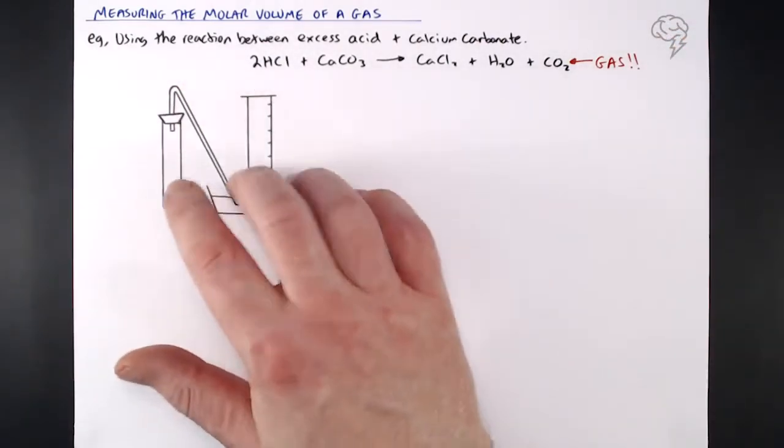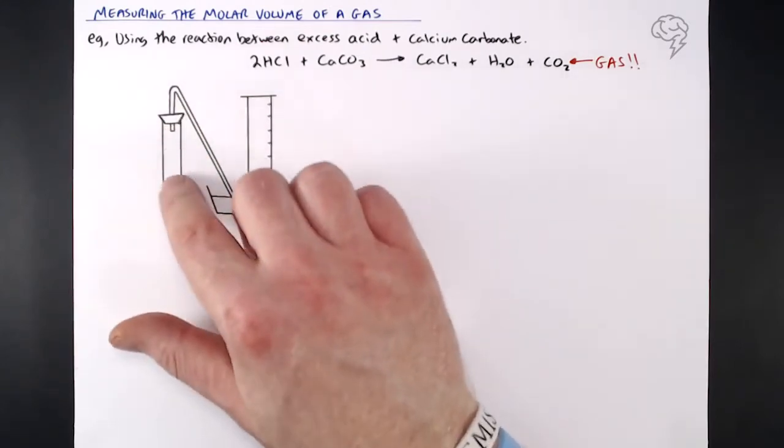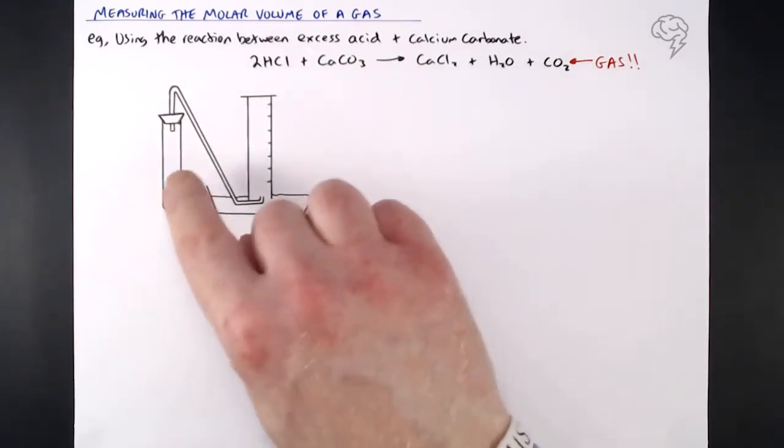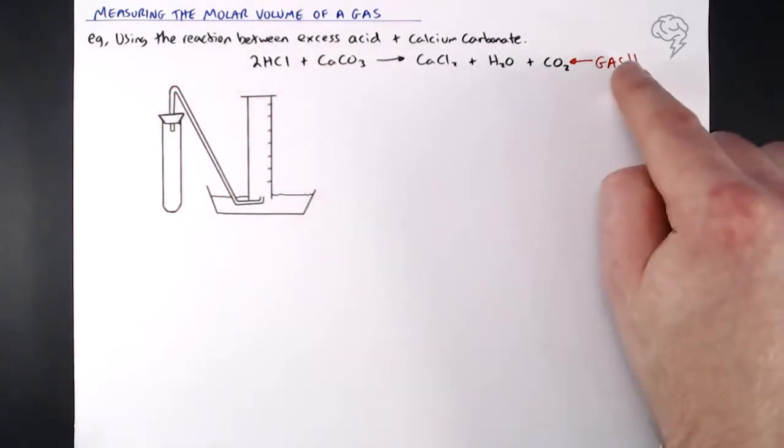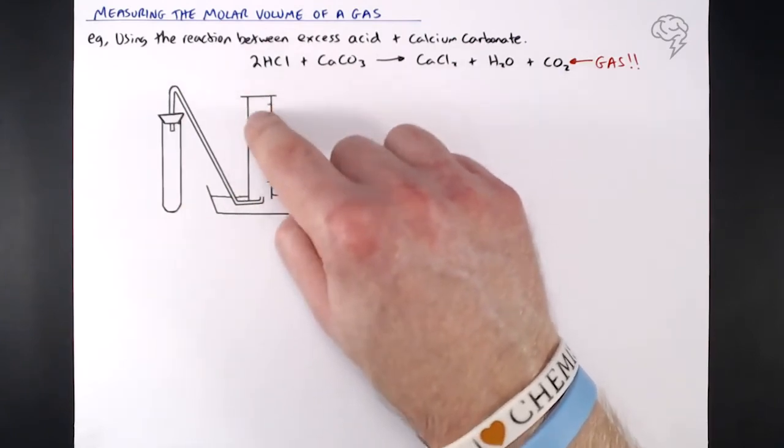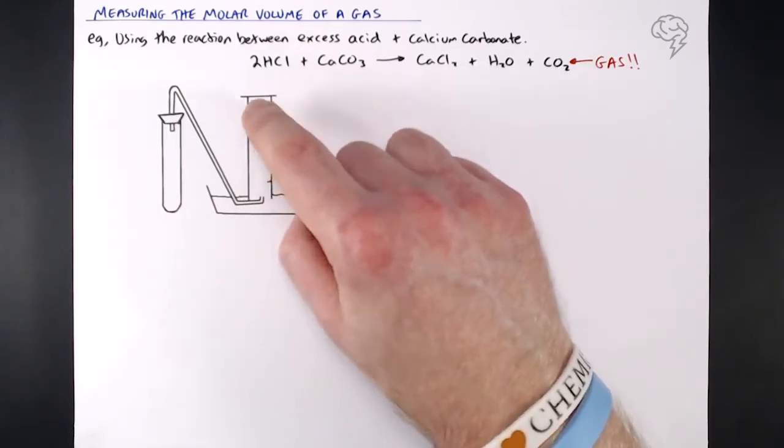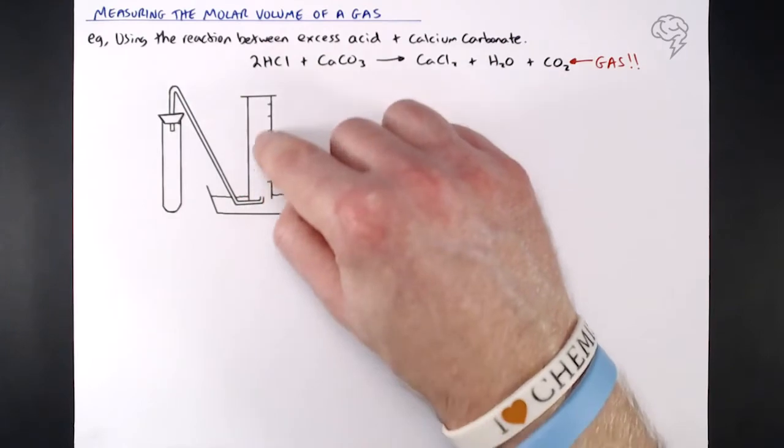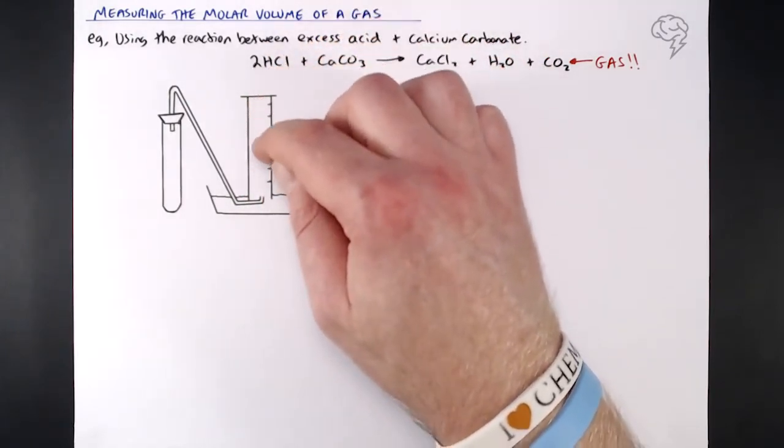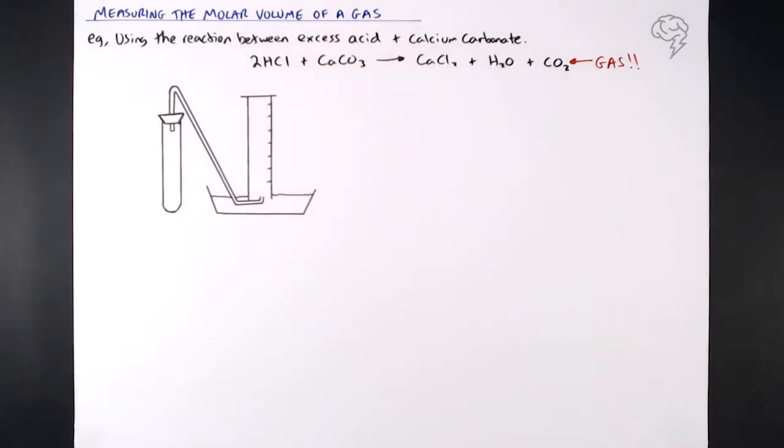On the left hand side here, we've got our equipment. Standard kind of boiling tube, this is where a reaction is going to take place. Any gas that's given off, CO2, is actually going to fill or start filling this full inverted measuring cylinder. So this is filled with water, as the gas goes through, then the water is displaced, and we can measure the volume of gas given off by this reaction.